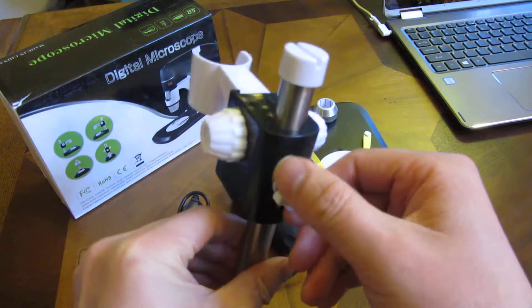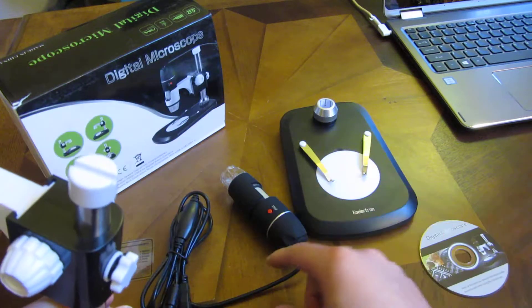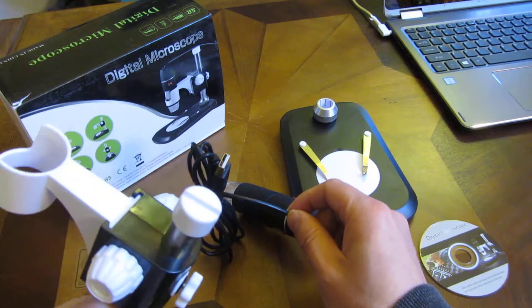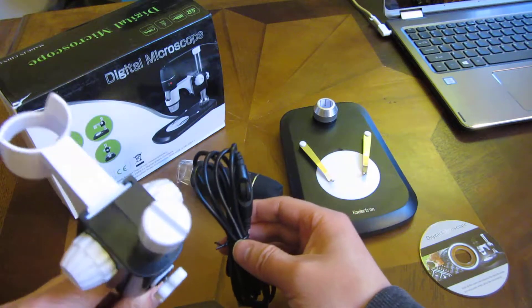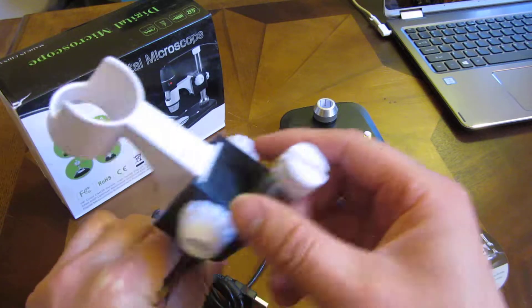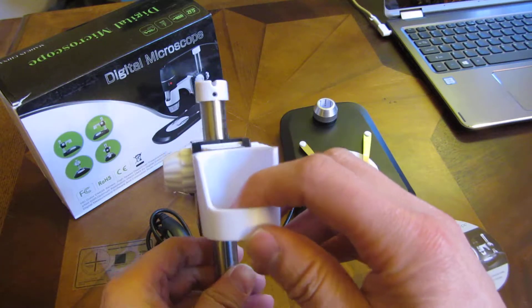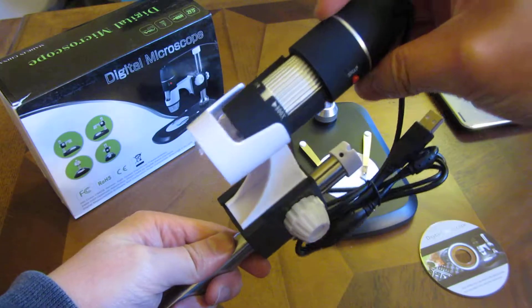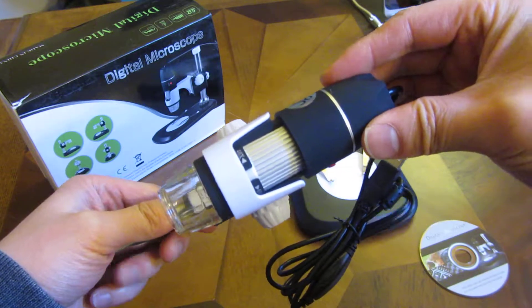Once that's tightened, it holds it in place. Now this slit here holds the camera wiring in place — that's what this particular slit is for. And you want it in this particular position, because what you would be doing is actually resting the camera like this.